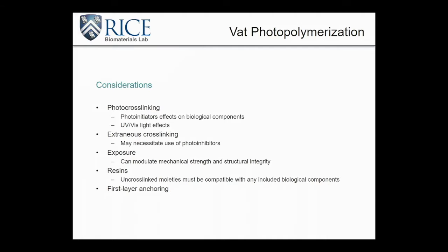So because Vat photopolymerization is so different than some of those other techniques we mentioned, there are some additional considerations that you want to keep in mind. In this case, photo cross-linking is absolutely integral to the success of these prints. It's also important to consider how you're photo cross-linking these materials, because very often the materials that you use with cells, while they may be biocompatible, the cross-linking agents you use to initiate those photo cross-linking reactions may have drastic effects on cell viability.